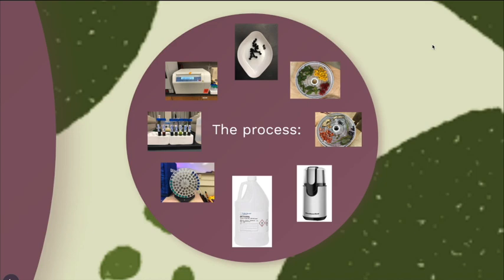After some background research, we selected our experimental plants and decided which plant parts to examine. Here at 12 o'clock, we see some goji berries. We put our cleaned materials into a food dehydrator and dried them at low heat for several days, at about 130 degrees Fahrenheit. The low heat was to ensure that we did not denature the antioxidants in our plant cells.